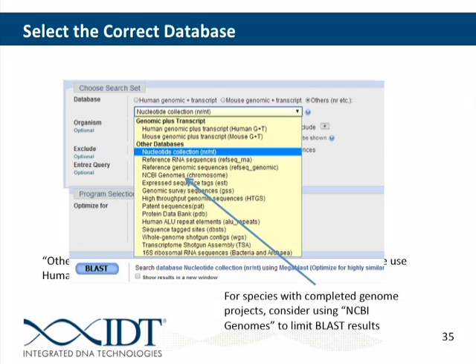So the reverse primer, you don't reverse complement it? Yes, you can. You'll get the same BLAST output whether or not you keep the primer in reverse complementation or not, but your output will look different. So it's best to reverse complement your primer.